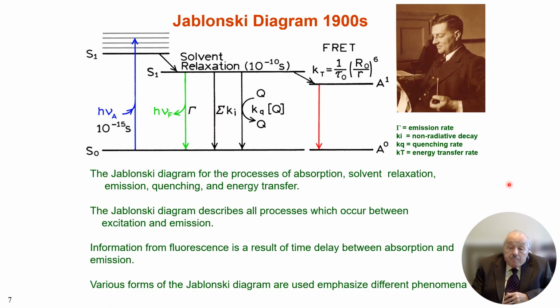Jablonski, now from Poland, which I'm very proud of, was the next pioneer in fluorescence, and he created what's called the Jablonski diagram.